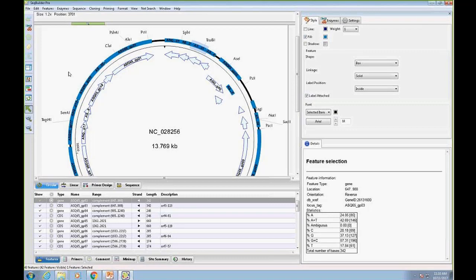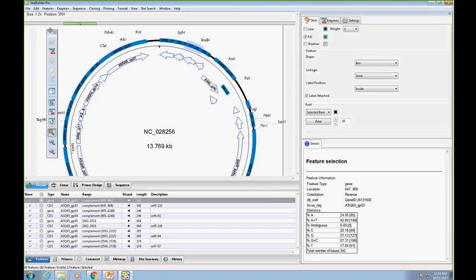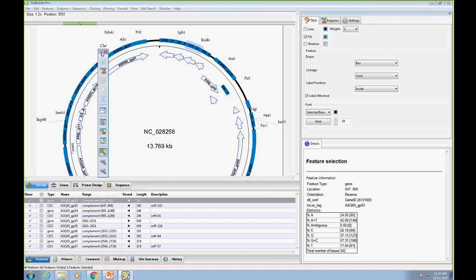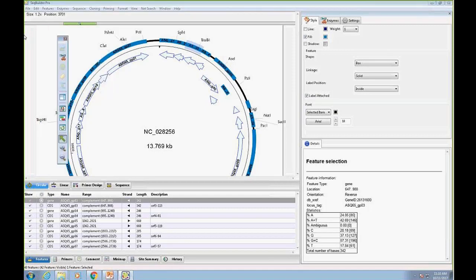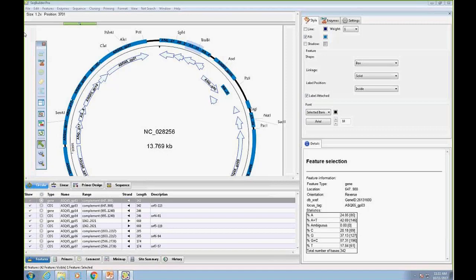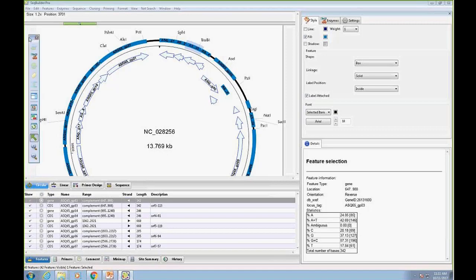There's also a new toolbar on the far left for version 15, providing all different options we'll go through as we switch views. The toolbar can be made to float, detached, and repositioned.